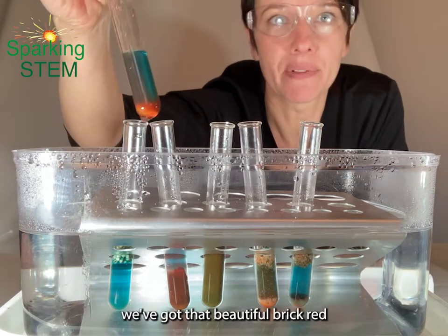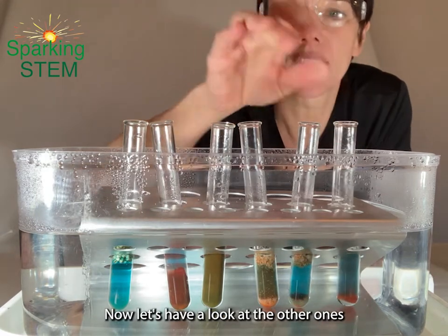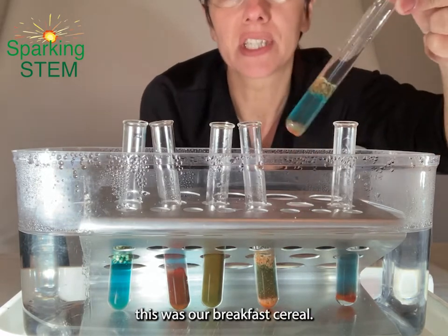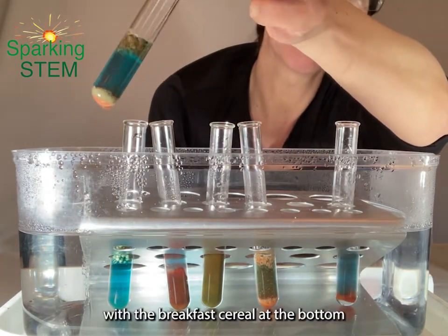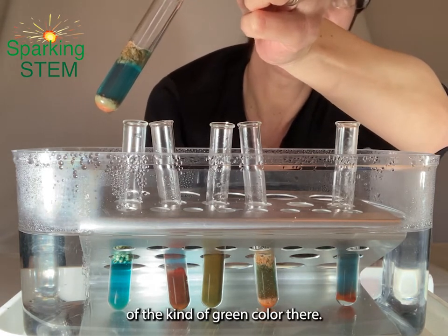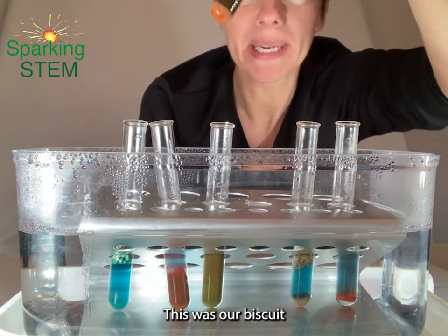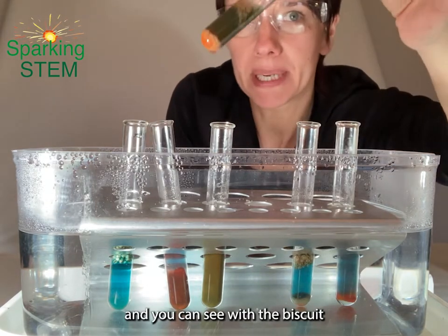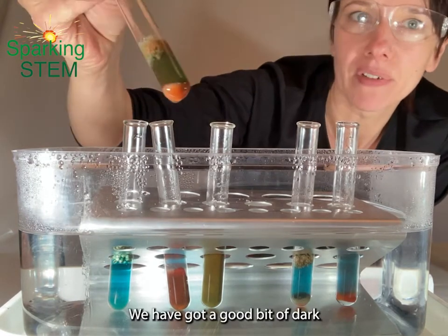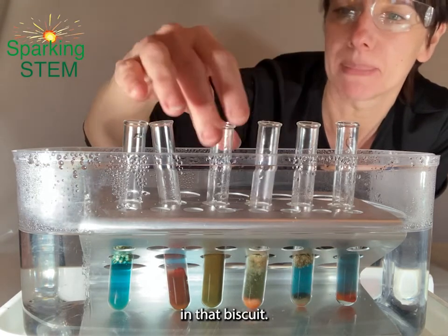This was our pure glucose and you can see we've got that beautiful brick red precipitate at the bottom. Now let's have a look at the other ones. This was our breakfast cereal — you can see at the bottom there we've got a bit of brick red precipitate and a kind of greeny colour, so we've got a bit of glucose in there. This was our biscuit — you can see we have got a good bit of dark orange, brick red precipitate at the bottom, showing quite a bit of glucose in that biscuit.